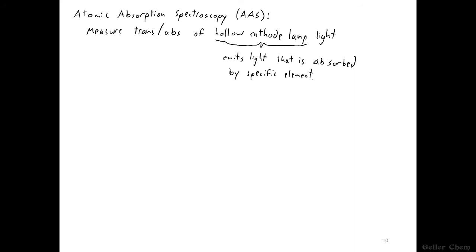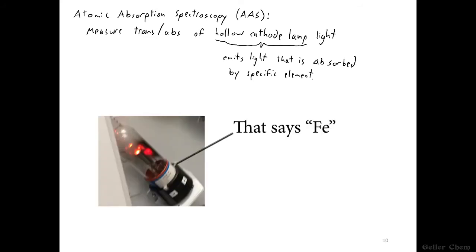So we saw in that instrumental video that the lamps are labeled by specific elements, like iron. An iron lamp shines in lights of wavelengths that only the iron electrons should absorb. They're compatible with the iron's energy levels and delta E's as opposed to, say, copper's.